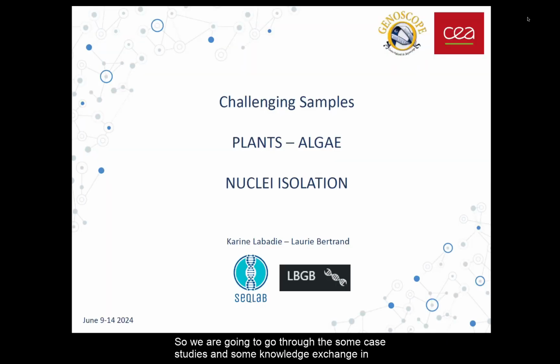So we are going to go through some case studies and some knowledge exchange on nuclear isolation and things. I will show you some slides of what we obtained at the Genoscope for the client samples from plants and algae.